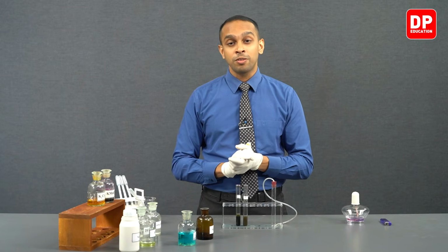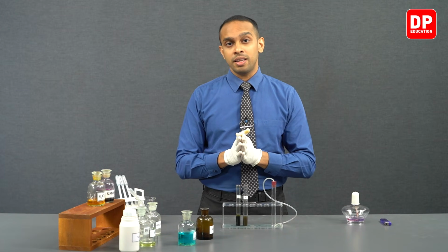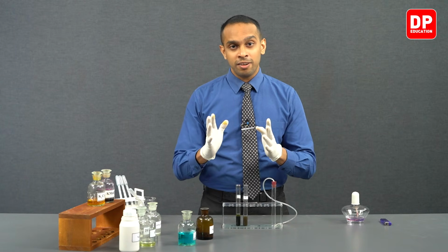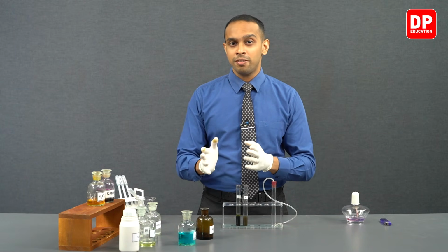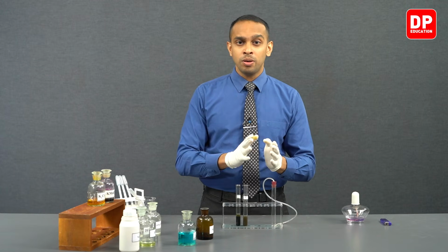So students, we observed when silver ions come into contact with sulfide ions, we form silver sulfide, a black color water insoluble precipitate. Or if you introduce cupric ions or Cu2+ ions into a sulfide ion solution, we saw the formation of cupric sulfide, which is also a black color precipitate.